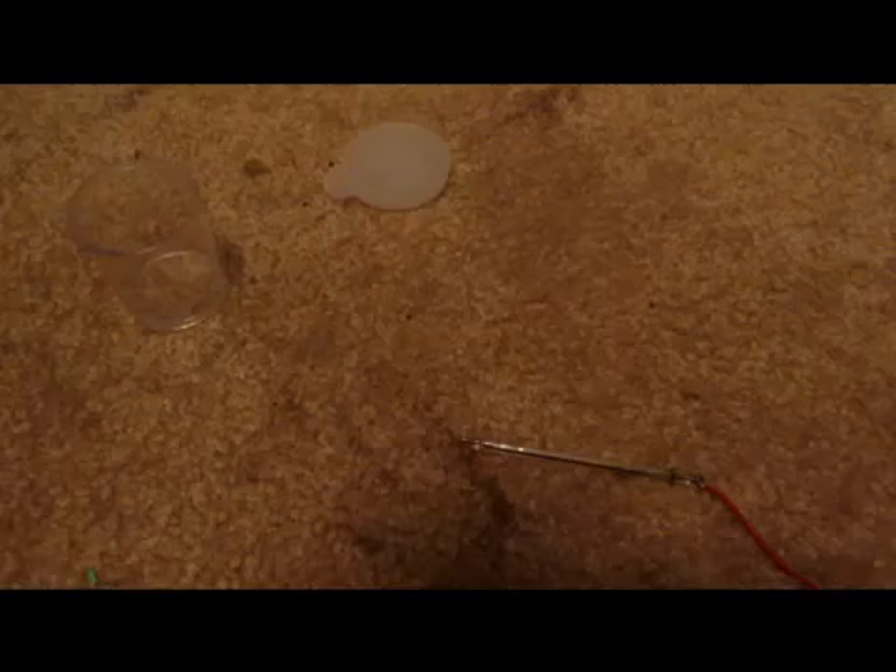Hey guys and welcome back to how to make elements from household materials. Today's element will be molybdenum.